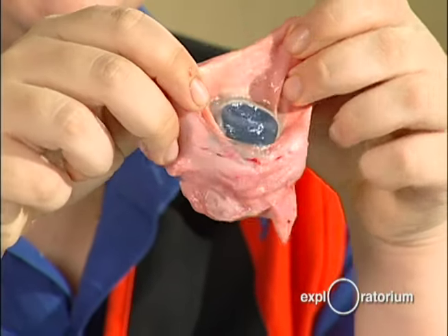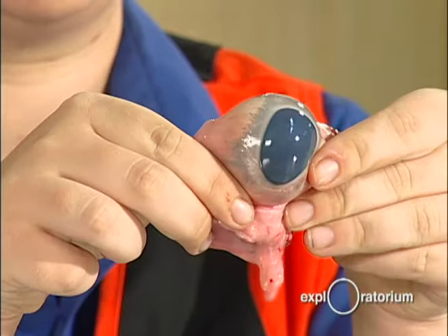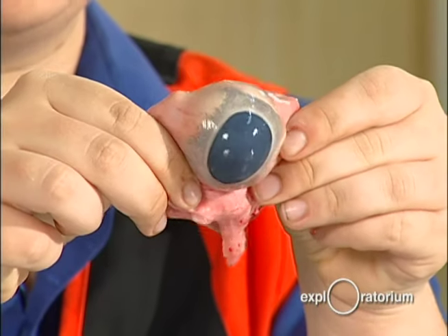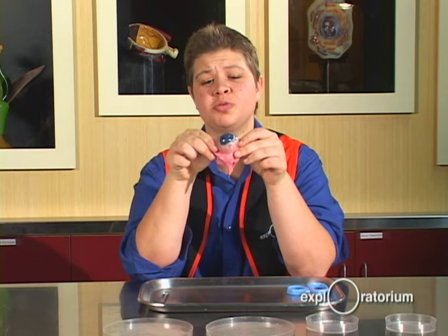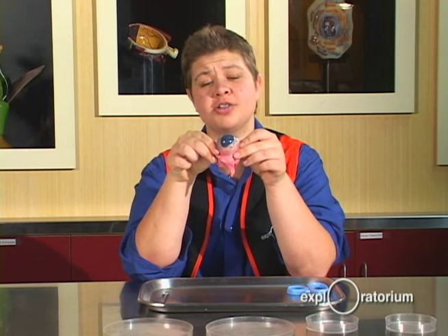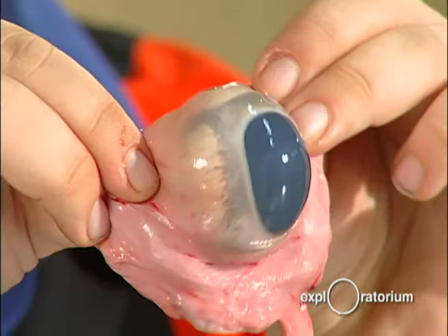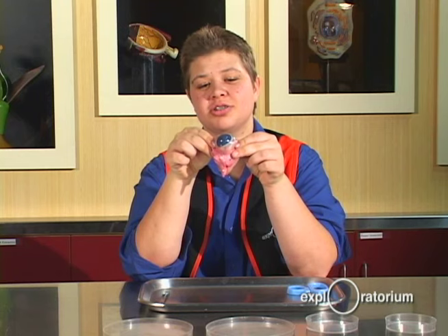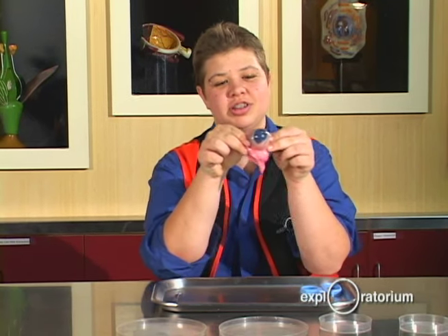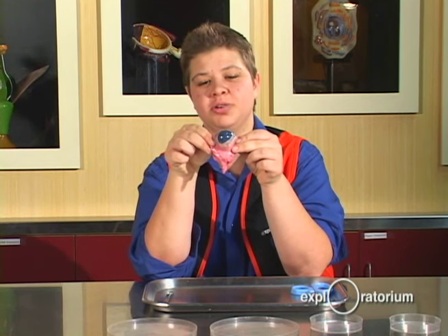The cow eye has primarily four muscles that allow the eye to move up, down, left, and right. The human eye has two more muscles that allow the eye to move more freely. That's why if you look at cows, they move their heads, but humans keep their heads still and their eyes do the moving.